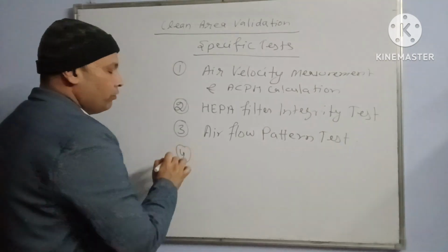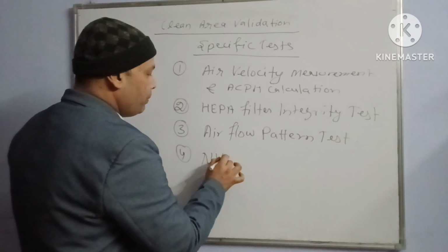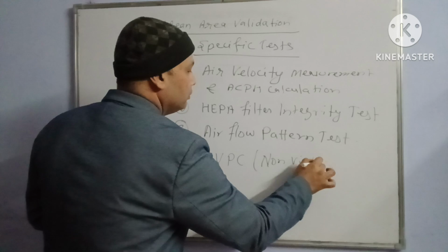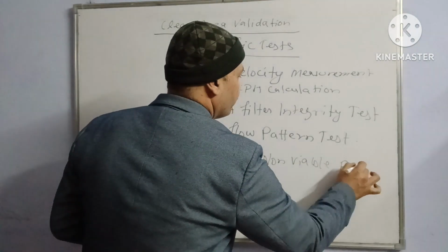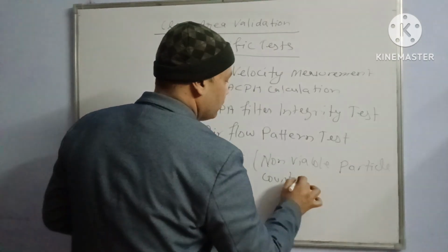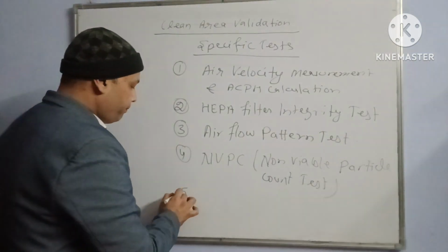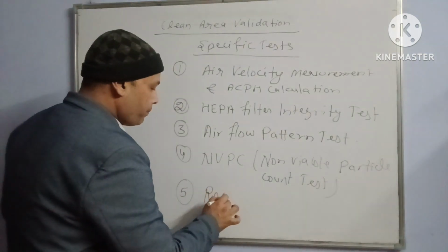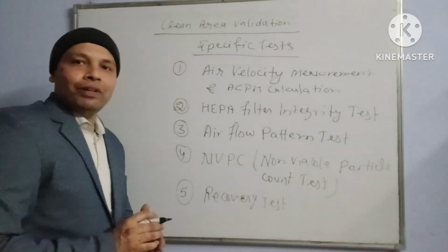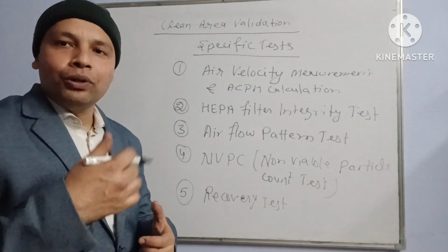Then fourth, we perform the non-viable particle count test. NVPC. It is the non-viable particle count test. In specific tests, lastly we perform the recovery test. Recovery test of the area. These are some specific tests that we are going to perform during the validations.